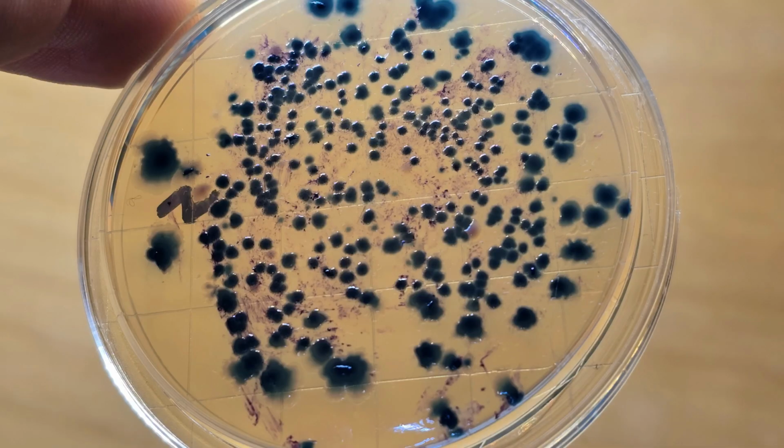Here's another contact plate, and this is directly from sewage. It looks completely different. Yes, you have some red colonies, and that's fine, but then you see all these dark blue colonies. Lots and lots more, and that's E. coli. That is a true directly-from-sewage plate. So that's really what we're looking for.